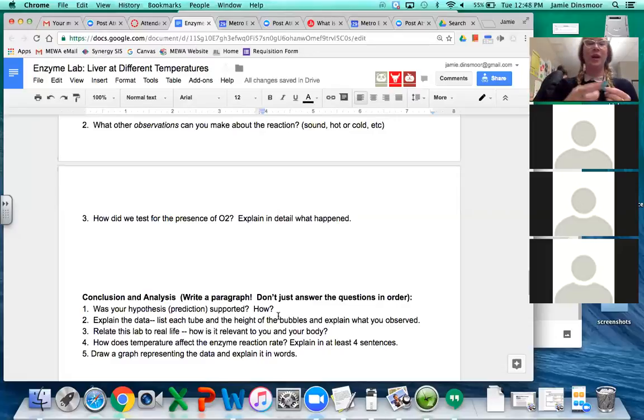Plus, you're about to have to write about what we did. That's too short. Ooh, colored toothpicks. Will it make a difference? Okay. It's just so close. It's like not quite enough oxygen. What is that? Oh, there's bubbles on it.